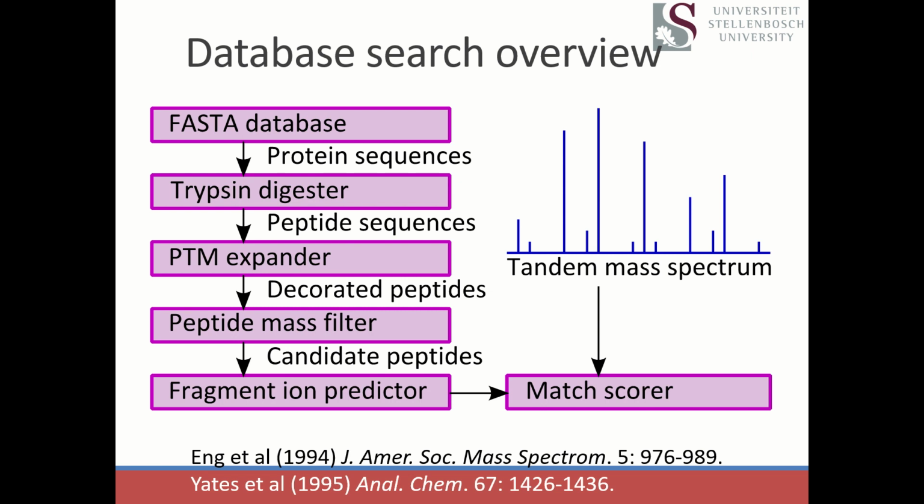So it's a case where we've learned what protein sequences exist for humans by annotating the genome. So we might start with that set of protein sequences as our input. If the protein of interest is not in the lookup table that we've created, if it's not in the sequence database, we cannot identify it by database search.